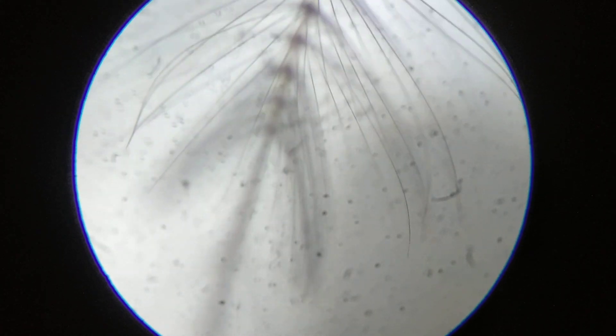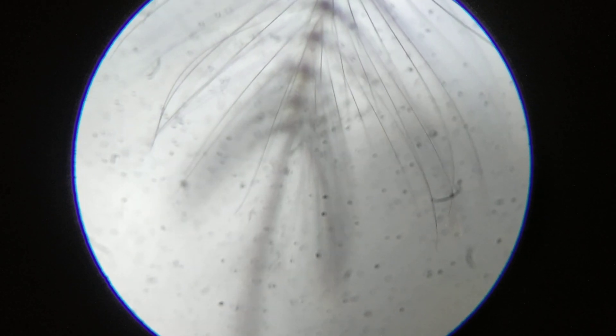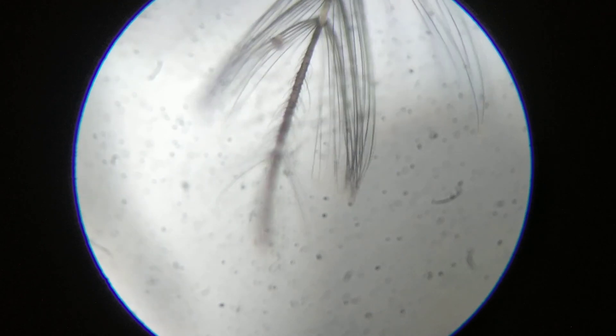You can see it's very feathery. This has been magnified 150 times as you can see over here.